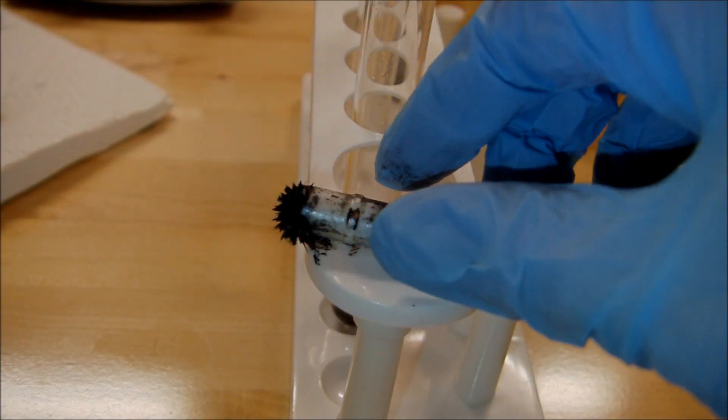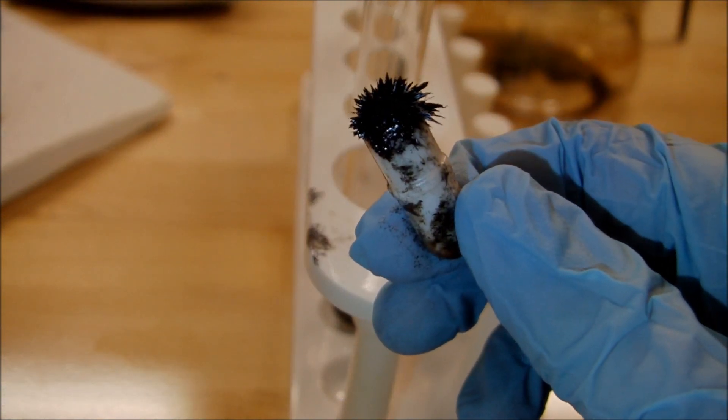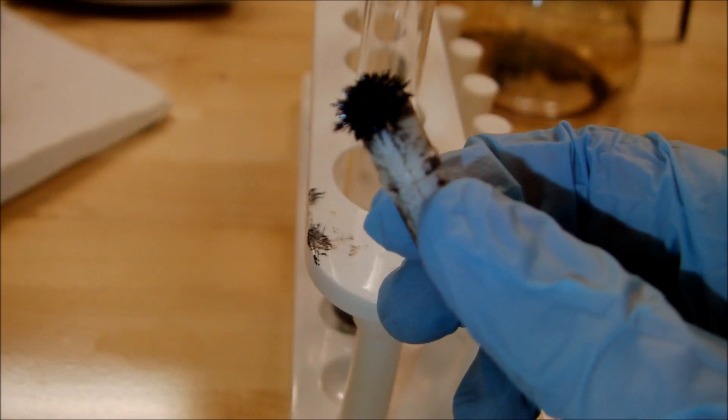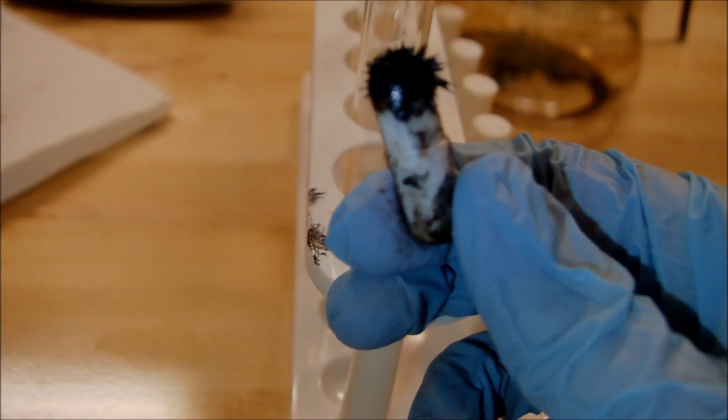It turns out it's kind of a dumb idea to use a magnetic stir bar in a liquid that's attracted to magnets. Go figure. At least it looks cool.